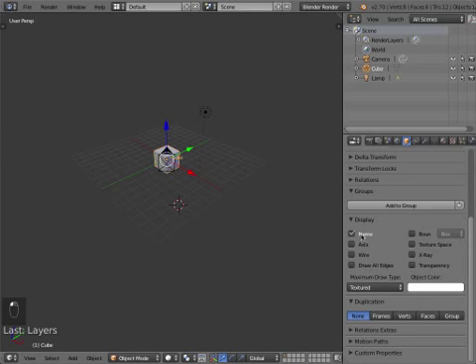And you can force other things to be drawn as well. Sometimes it makes sense to draw the name and the wire, but the wire is chosen now anyway. And draw all edges, especially if you work with analysis meshes, because otherwise you might look at your mesh and wonder why there's an edge missing and it's just not drawn.